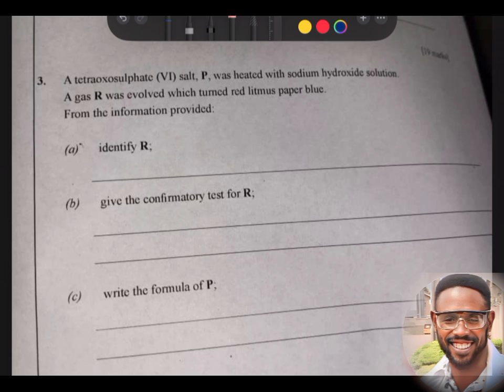I don't know, because if you have the highest lawyer, highest barrister, you might talk down on me and say they purposely put it to know if the students are doing it. Don't say that thing. Because with sodium hydroxide and glucose mixed with copper 2 sulfate, what would they report as their inference? Light blue gelatinous, which dissolves to form a deep blue, and on standing, turns greenish and starts... Oh boy. I don't know you. Whatever you turn around is your business, but I'm here standing in for science. It doesn't make any sense. You don't. I was a victim. I assumed that same thing until I did it. I was shocked. So I know how they feel.